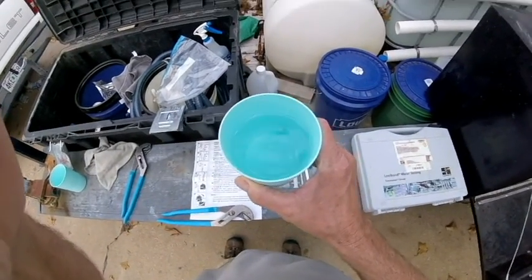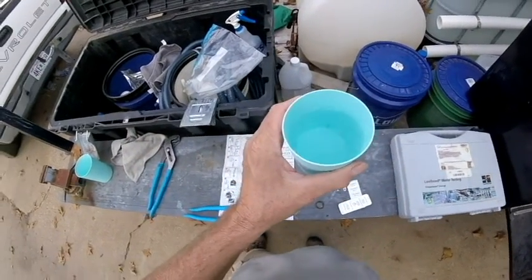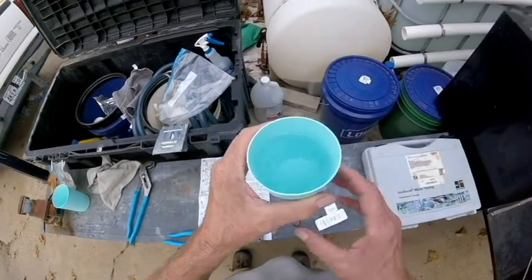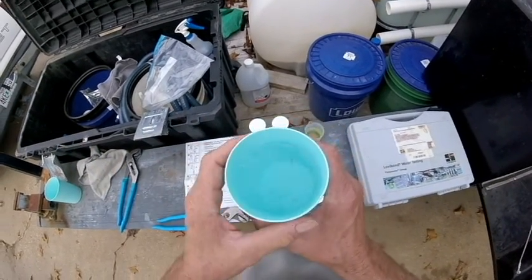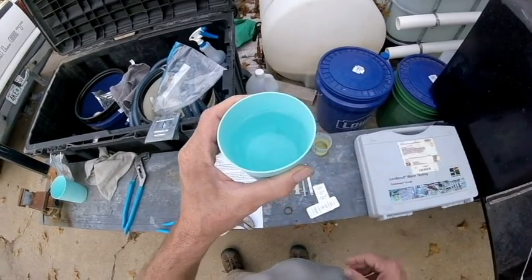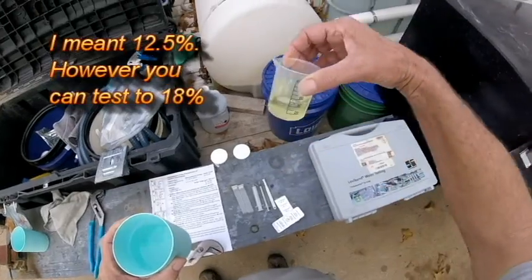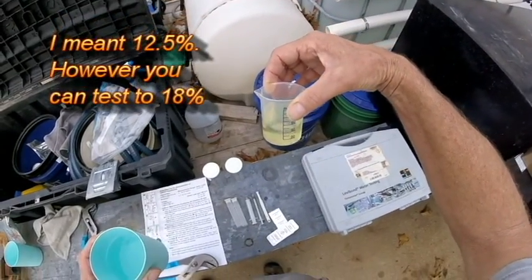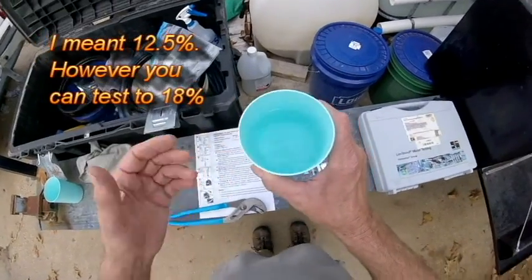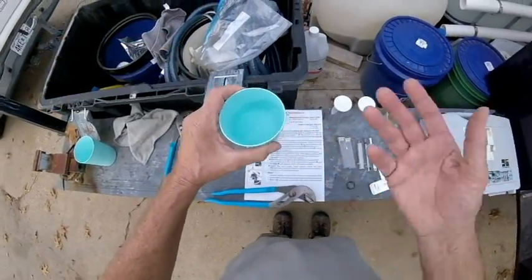One of the first things you need to do is have chlorine-free water. You can get distilled water, or you can set your tap water out for a day — you just don't want any chlorine in it. In reality, I don't think it's going to make a big difference because if we're talking about drinking water that's just a few parts per million, as opposed to checking 18% bleach. I have a reverse osmosis filter so there's no chlorine in this water, and that's what I use.